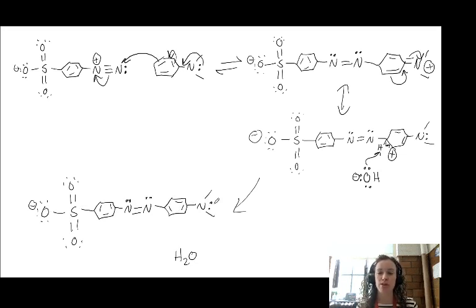You might recall that just last week with the aldol reaction, we made a slightly yellow-colored molecule due to the extended conjugation across that molecule. This is even bigger, even more conjugated. So keep an eye out on what happens in the various steps in this reaction and look for color changes.